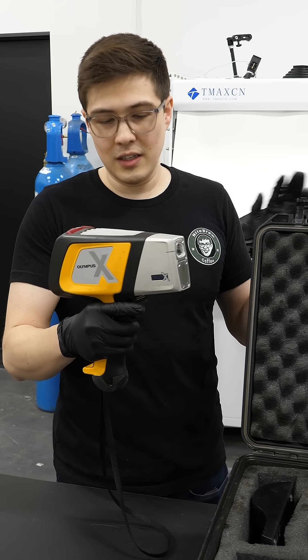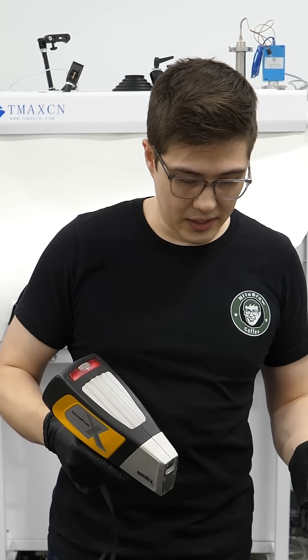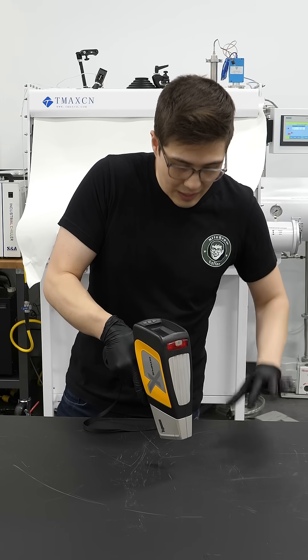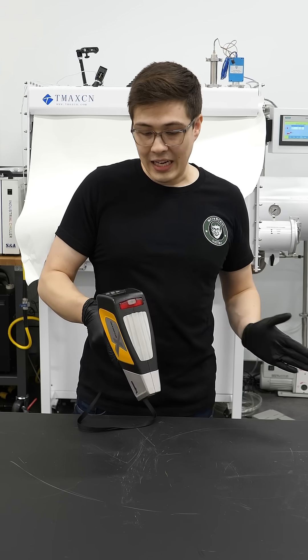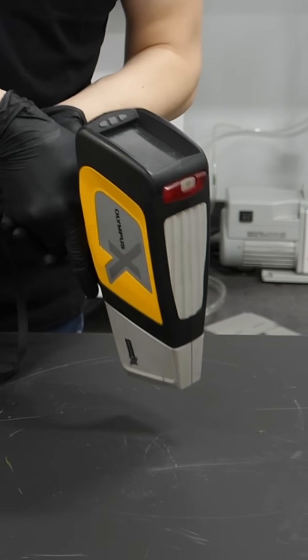So what do we use that for? What it does is it allows us to blast things with x-rays, and when that happens, it causes the thing we're blasting to emit x-rays back, which then gets sensed by the gun. Every element emits a characteristic x-ray, which basically means we can just point it at things and it will tell us what it's made of.